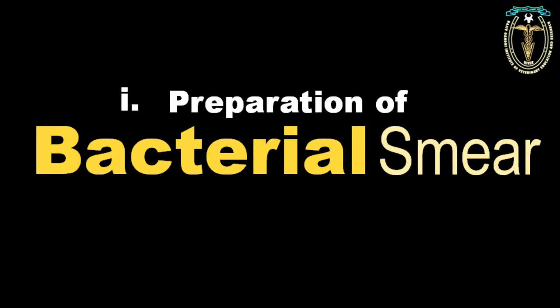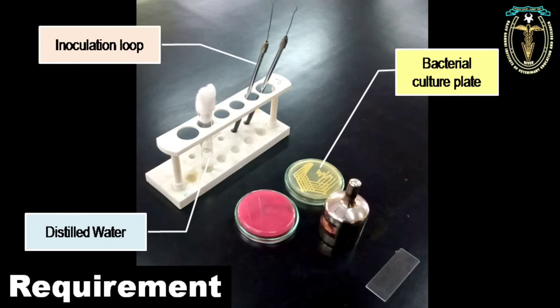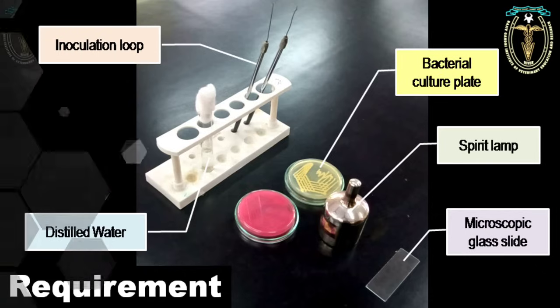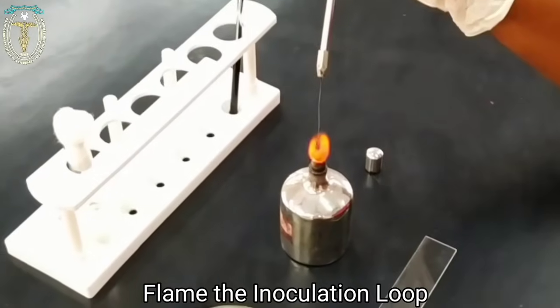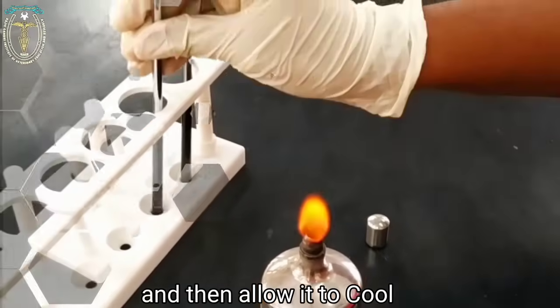The video demonstration. First, we will see about the preparation of the bacterial smear. The materials required are the bacterial culture plate, the inoculation loop, the distilled water, the spirit lamp, and the microscopic glass slide. These are the requirements for preparing the bacterial smear. First, ignite the spirit lamp. Flame the inoculation loop to red heat. And then, allow it to cool.